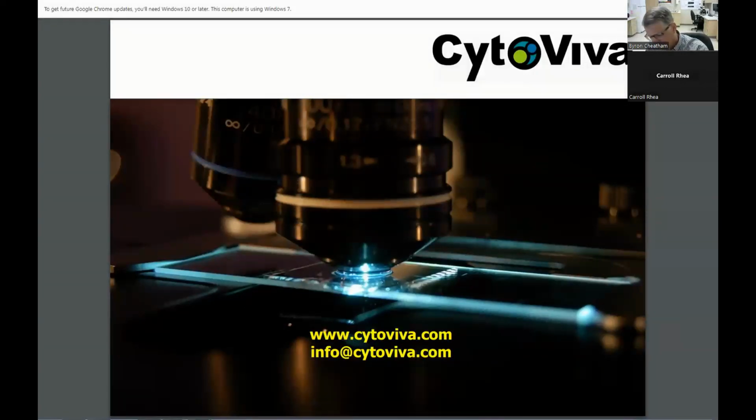We've even looked at things, for example, as you know, Giardia is a waterborne pathogen that can cause major havoc in water drinking systems, potable water. And we looked at therapeutic nanoparticles that absolutely destroy the Giardia pathogen over time. That's an example of how it could be utilized. I didn't show any examples of that today. I think we may have some on our website. If not, we can share some. The Giardia just gets destroyed by the silver nanoparticle interaction.